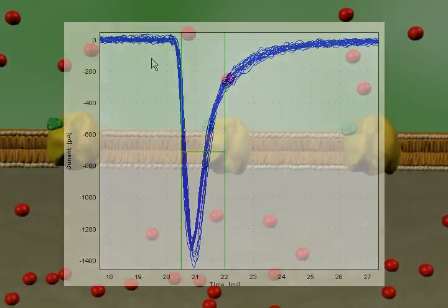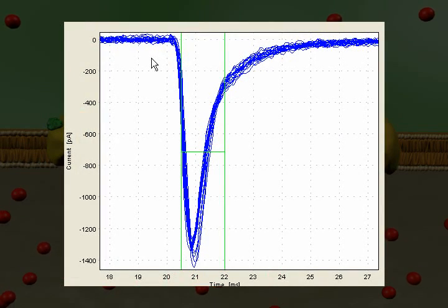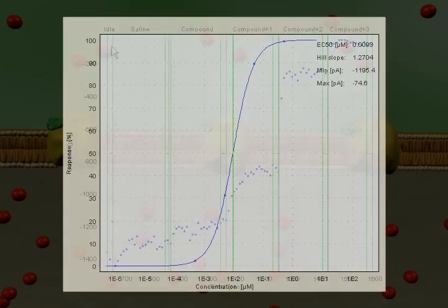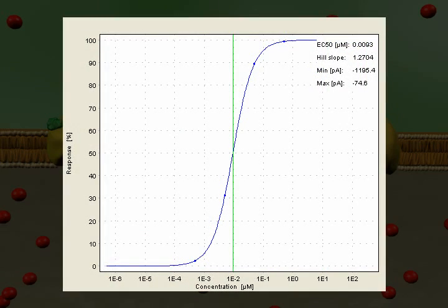Once the experiment is complete, the Q-Patch assay software quickly helps you go from raw data to current versus time plots to dose-response curves, complete with EC50 values.